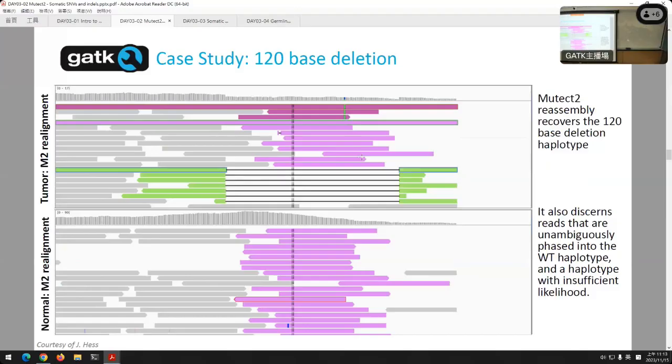So there are cases like this when you're analyzing cancer cells where, by building on top of the haplotype caller, we can get a lot better information about what's going on, including weird deletions like that. There's signal there, even if it's noisy when you're looking at the actual reads in IGV, but here we can go beyond just saying something's happening to identifying, no, we know what that is now. It was a 120 base deletion.